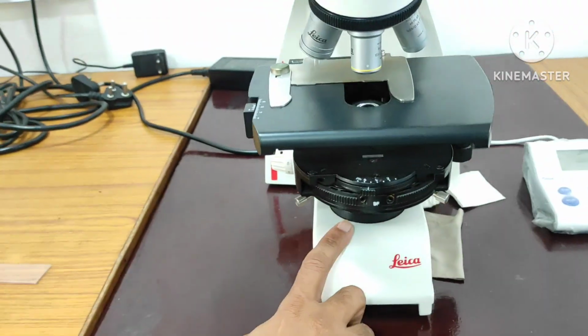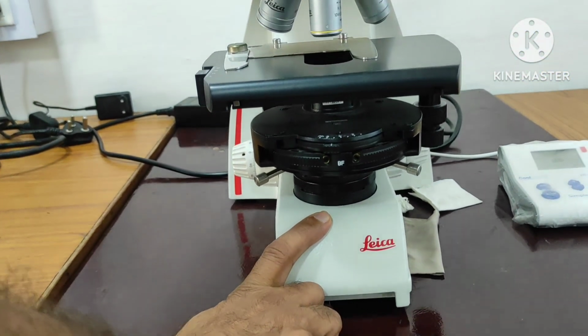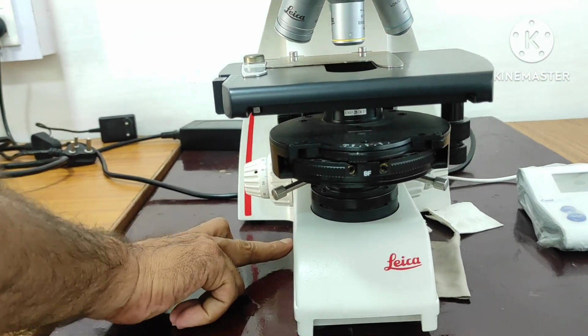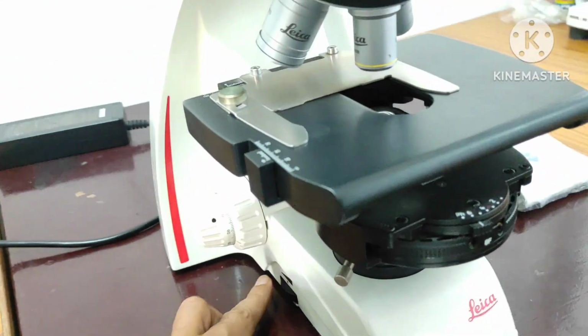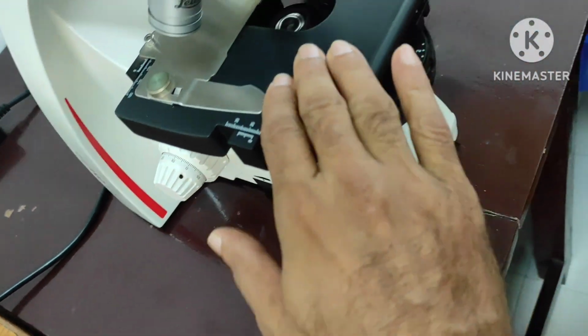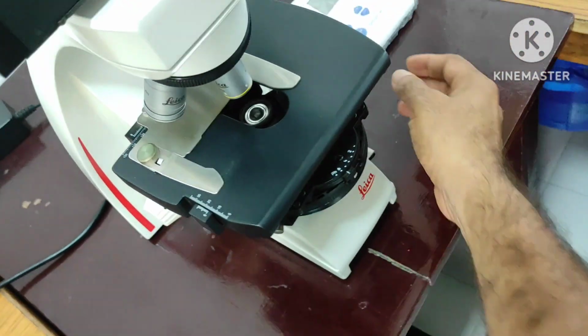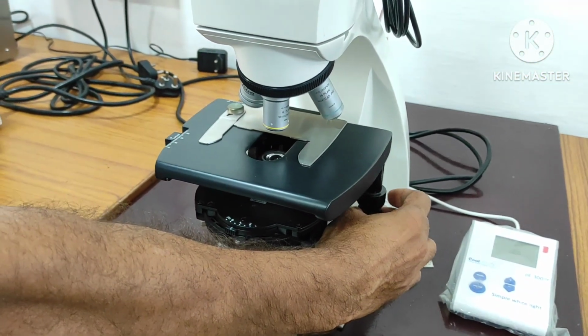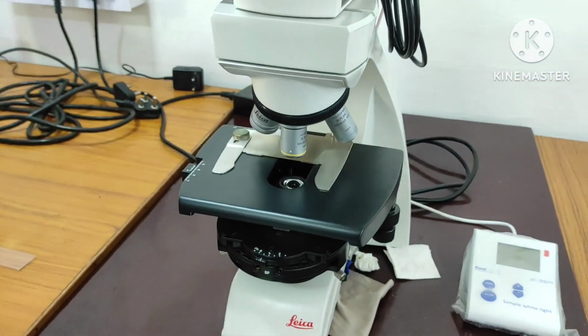And this source of light is also inbuilt here, and the light can be adjusted here also, right, how much light is needed. So an adjustment knob is also there, right. And with that, this is the stage, clips are also there, and the movement of the stage is also there. We can move the slide with the stage, no need to touch it once we install it.